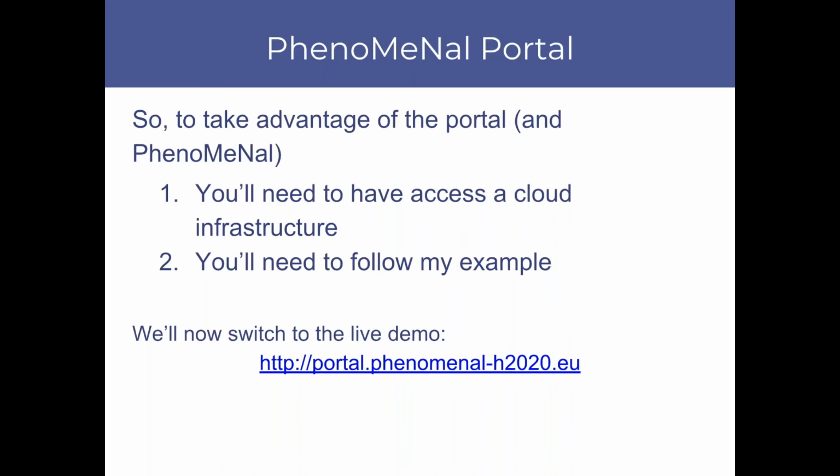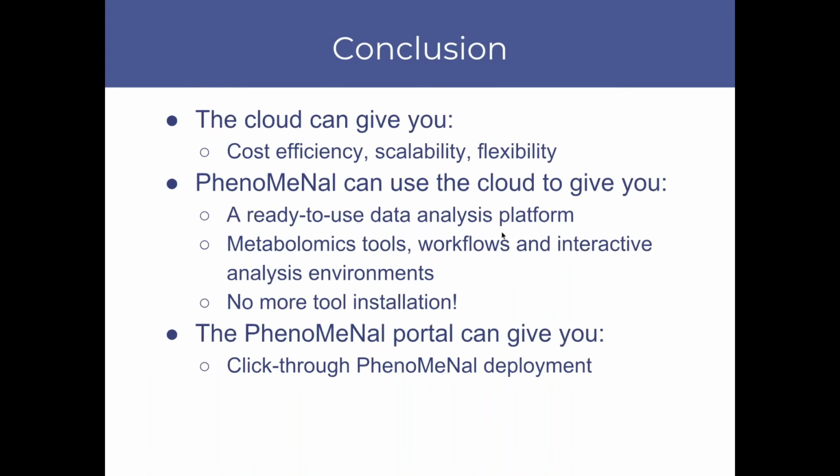Okay, here we are again. So in conclusion, the cloud can give you cost efficiency, scalability, and flexibility. PhenoMeNal can use the cloud to give you a ready-to-use data analysis platform with all the metabolomics tools and workflows that are most commonly used, and an interactive analysis environment as well. This means that you can avoid having to do any more tool installations. The PhenoMeNal portal can give you a click-through PhenoMeNal deployment on your own cloud infrastructure or on a cloud infrastructure that you rent from one of the commercial cloud providers.